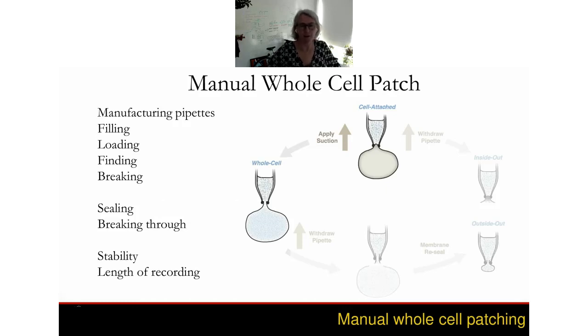So typically we're using the manual whole-cell patch clamp setup, which I learned as a graduate student too many years ago. But I think most of you are familiar with the power of this methodology, tremendous. But of course, in manual patching, you're using individual electrodes to patch, for example, individual cells. So in a teaching setting, we like to show the students how to start at the beginning and work through the flow and all of the logistics that are needed to set up the whole-cell patch clamp.